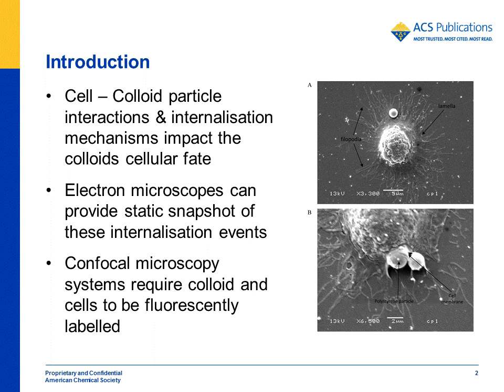The interactions of colloidal particles with cells is of great interest to scientists working in the field of drug delivery, given that the mechanism of cellular internalization of colloids greatly impacts their intracellular trafficking and resultant distribution within the cell. Early attempts at visualizing subcellular structures involved in endocytosis of particles, such as the clathrin-coated pits, were performed using electron-based microscopes. Despite providing unparalleled resolution, the electron methods only provide a snapshot in time of the internalization event.